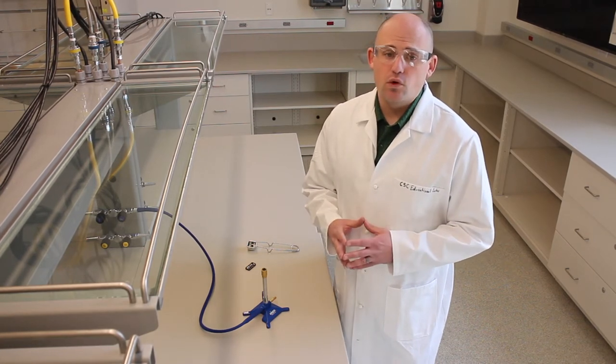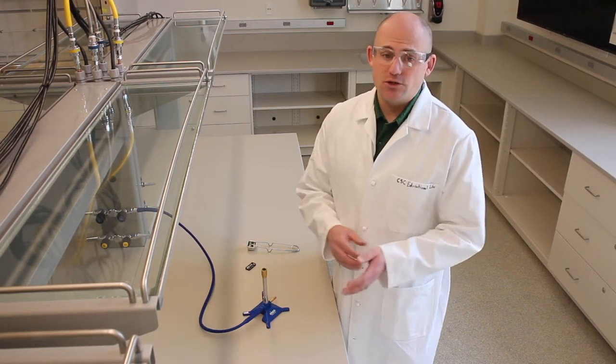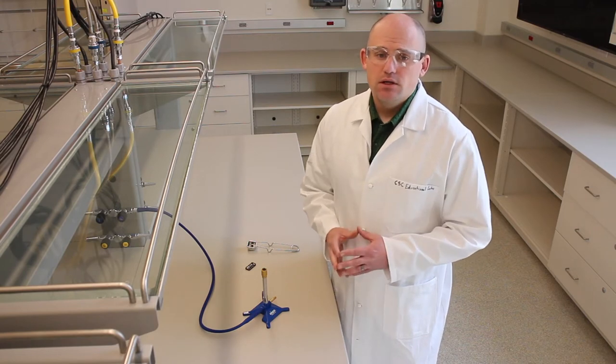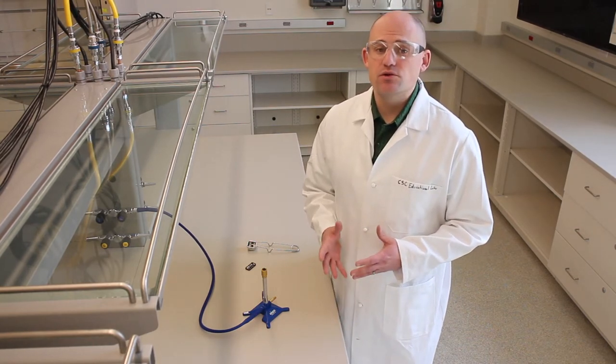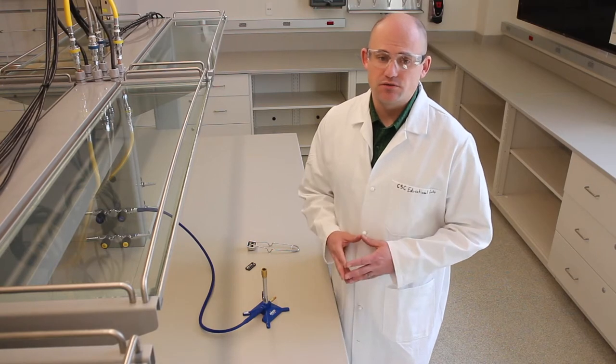Lab coats and clothing that are worn while working with a Bunsen burner should be natural fibers such as cotton. This will provide a little bit more protection than synthetic fibers in the event that your clothes or lab coat catch on fire.